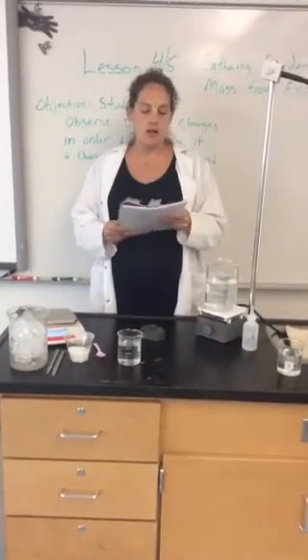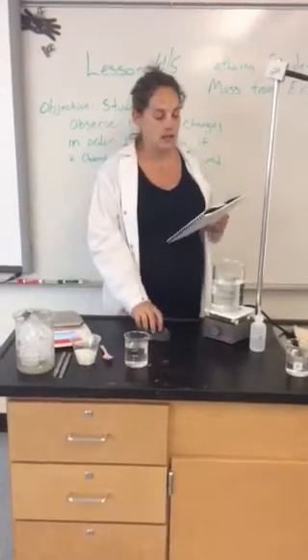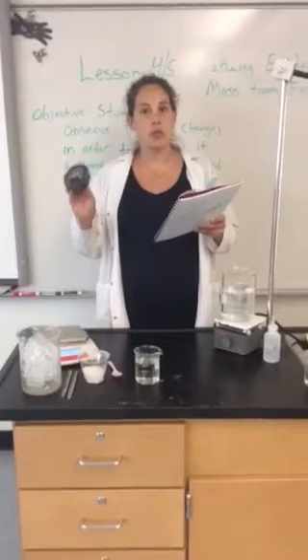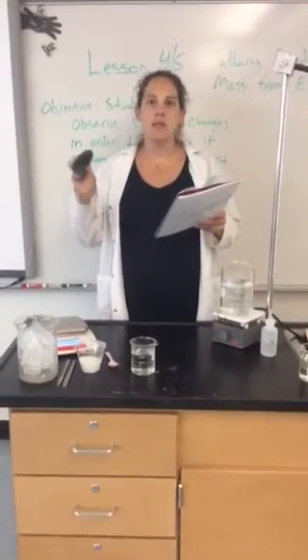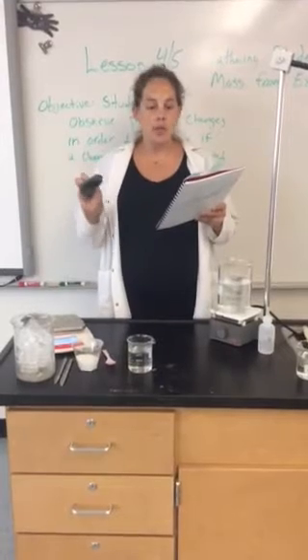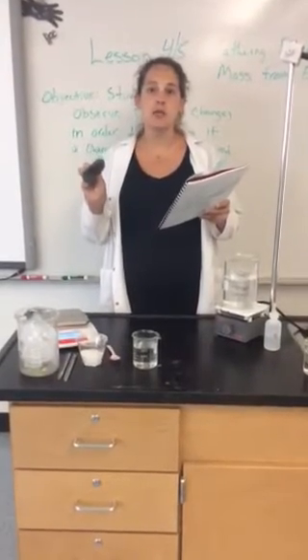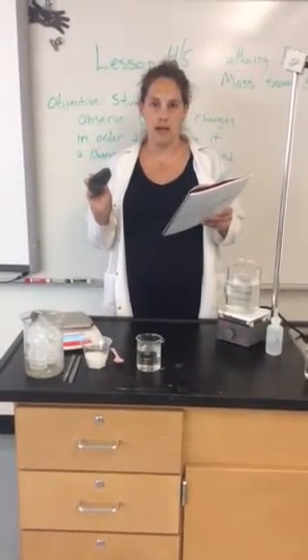a substance. The first demonstration was which has more mass, a tightly wadded ball of steel wool or the same steel wool stretched and pulled apart. If you had not made these predictions yet, pause this video, go back to the page Lesson 4 Does the Mass Change, and read each demonstration and make a prediction on what you think will happen to the mass.